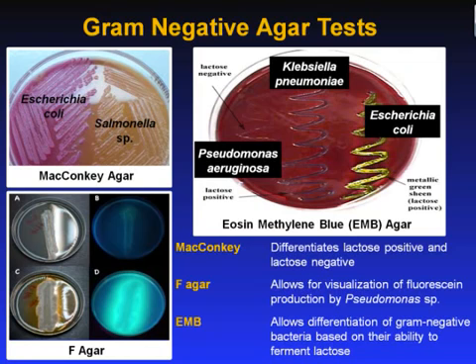Non-lactose fermenting bacteria such as Salmonella, Proteus species, and Shigella cannot utilize lactose and will use peptone instead. This forms ammonia, which raises the pH of the agar and leads to the formation of white or colorless colonies, or colonies that appear the same color as the medium. Some organisms ferment lactose slowly or weakly and are sometimes put in their own category. These include Serratia and Citrobacter.